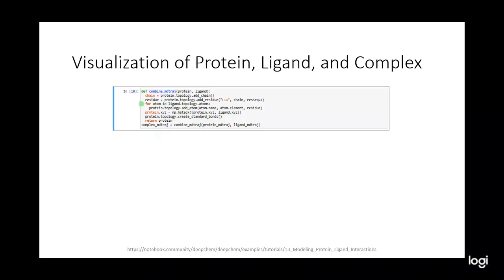This step effectively connects the ligand to the protein, creating a new protein-ligand complex topology. The actual atomic coordinates for these atoms will be determined in the later steps.